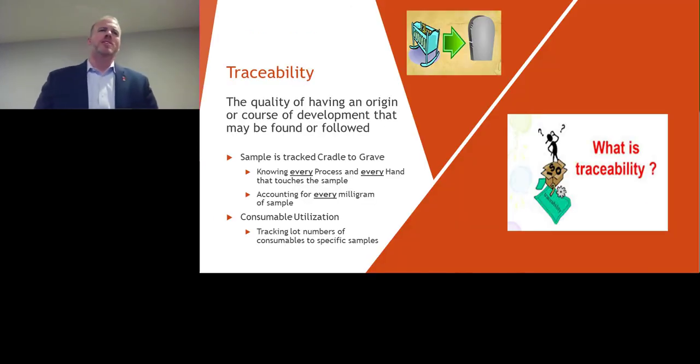So again, the word traceability comes into play, something I want to touch base on for a few minutes. Traceability is really the whole cradle to grave concept. You get a sample in your door, and it is your responsibility. You have to be able to show everything about that sample. That is every hand that touched it, every milligram that was used. You need to be able to show where it went, and that that particular part of the sample was destroyed properly or used up.